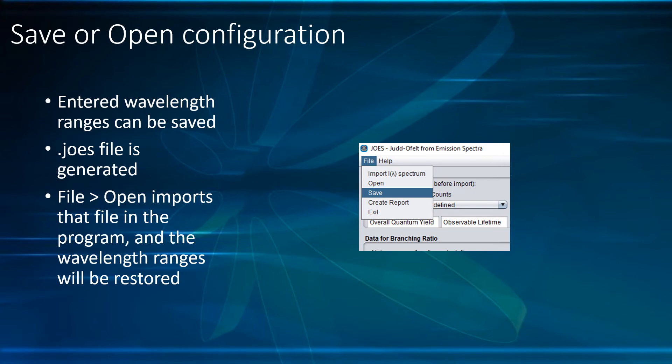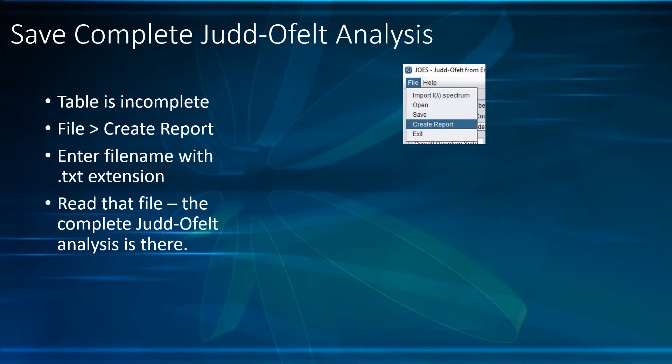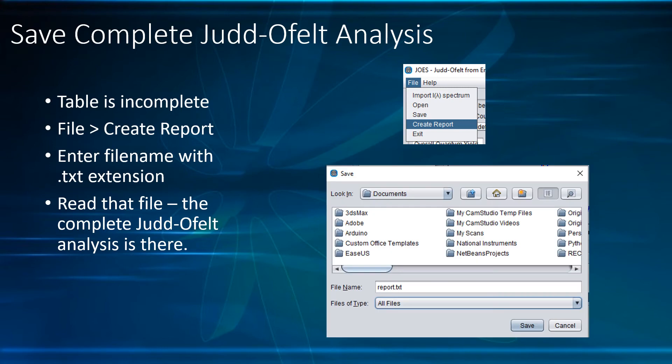To save the complete Judd-Ofelt analysis, click on File and Create Report. Enter the desired file name including the extension, and that file can be read in any text editor.